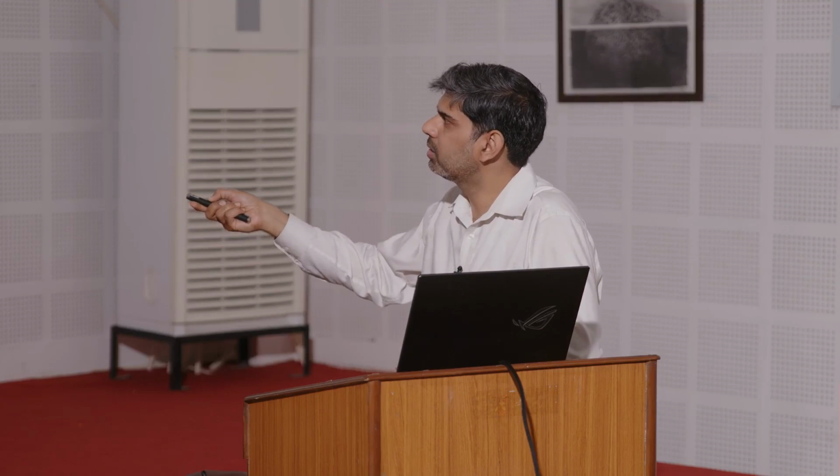Then we switch the voltages at the channel ends in a way that the electric field starts pointing from here, from left to the right. So, we do this. The initial band disintegrates into multiple zones which we detect.